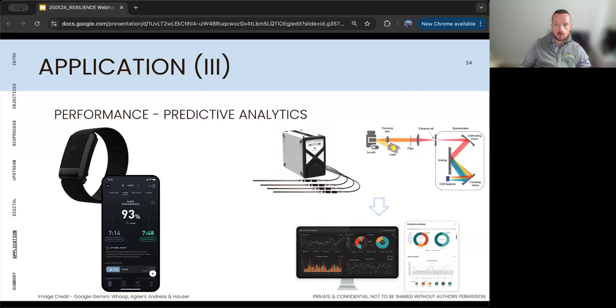And this is what we want for our bioprocess. There are incredible advanced analytics available now, such as the example of Raman spectroscopy here, which can measure many different process variables at once. But the challenge is in processing that immense amount of raw data and translating it into useful insights that can be reacted to. This is partly because we don't have the same level of underlying understanding in our system as we do about human performance. And it's partly because the systems to utilize this data aren't fully developed yet.